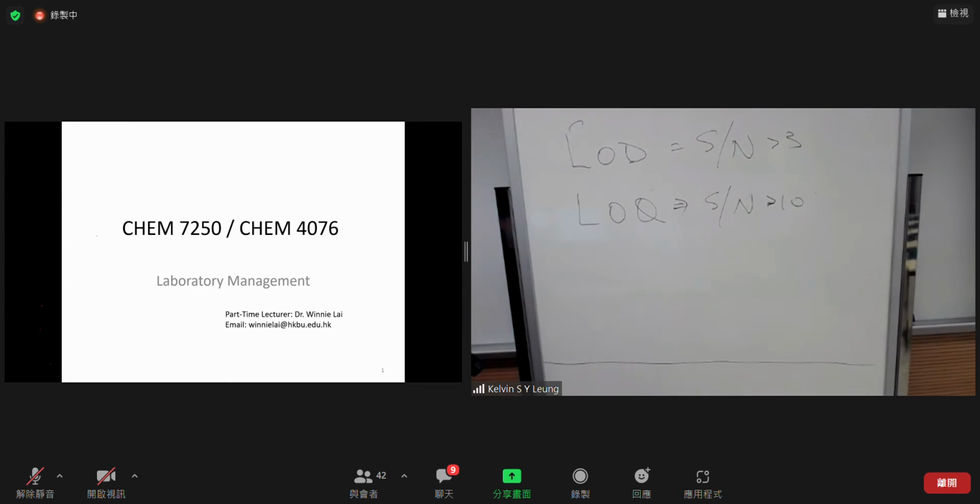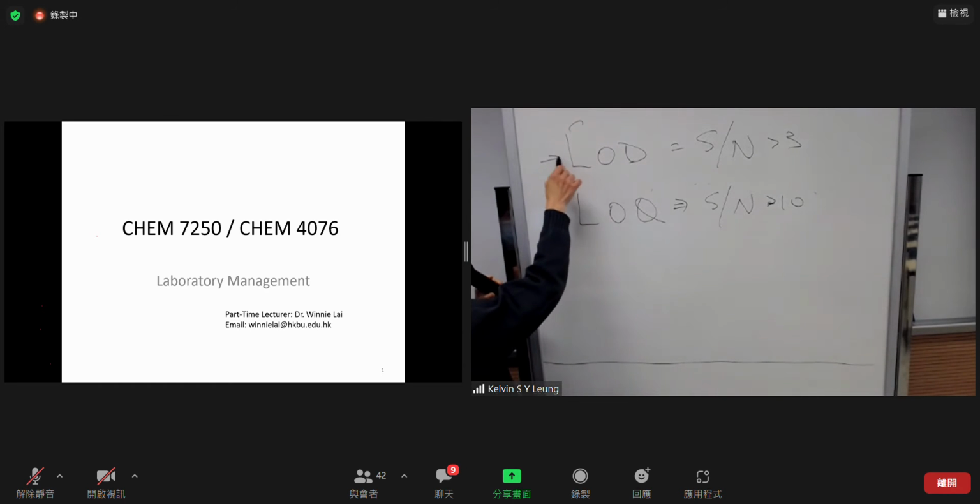For the LOD, in some testing labs, if you have some experience of sending samples to a testing lab, let's say you would like to test whether the phthalates content meets some European guidelines or European standard.